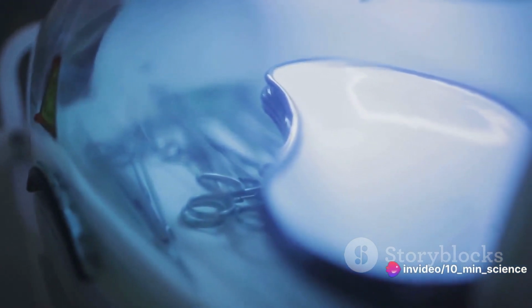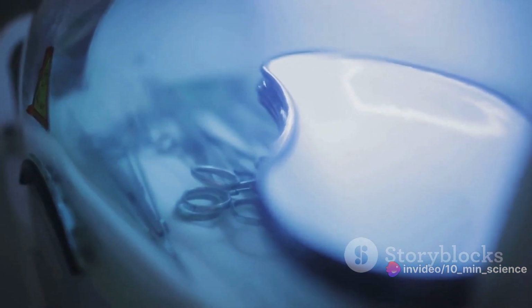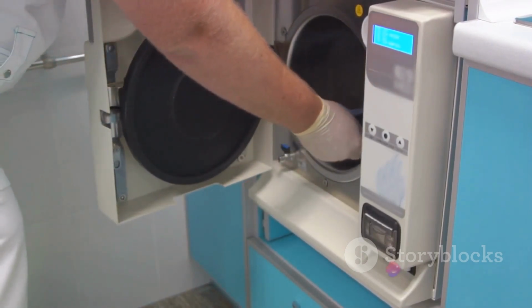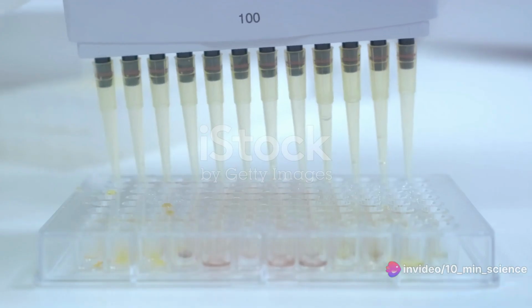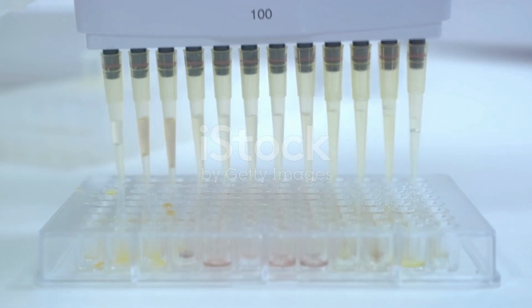This might be comparable to preheating your oven or ensuring your stovetop is at the right temperature. We need a suitable titration apparatus for this assay. The titration apparatus should be clean, calibrated, and ready to go. Calibration is key here. It ensures that our measurements will be accurate, which in turn assures the validity of our assay results. It's also important to prepare a blank solution. The blank solution is like a baseline or control in our experiment. It helps us eliminate any errors that might be introduced during the assay.